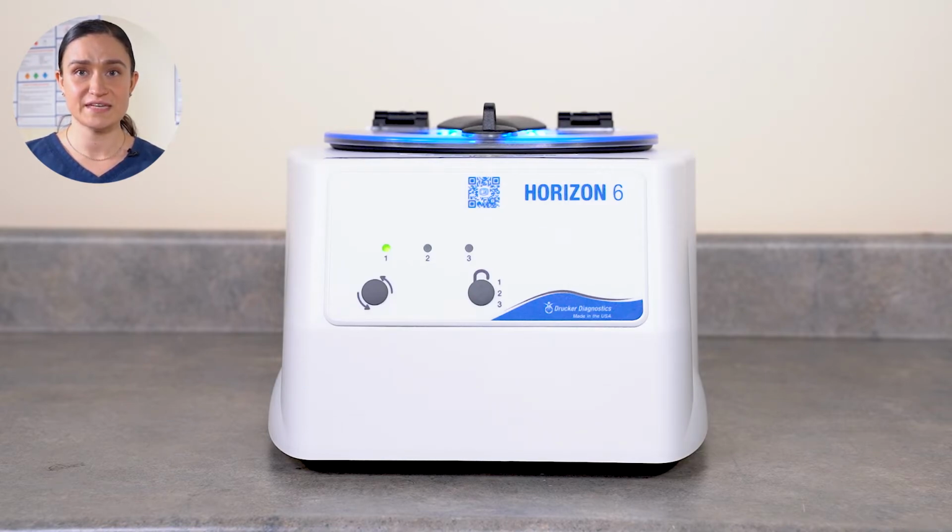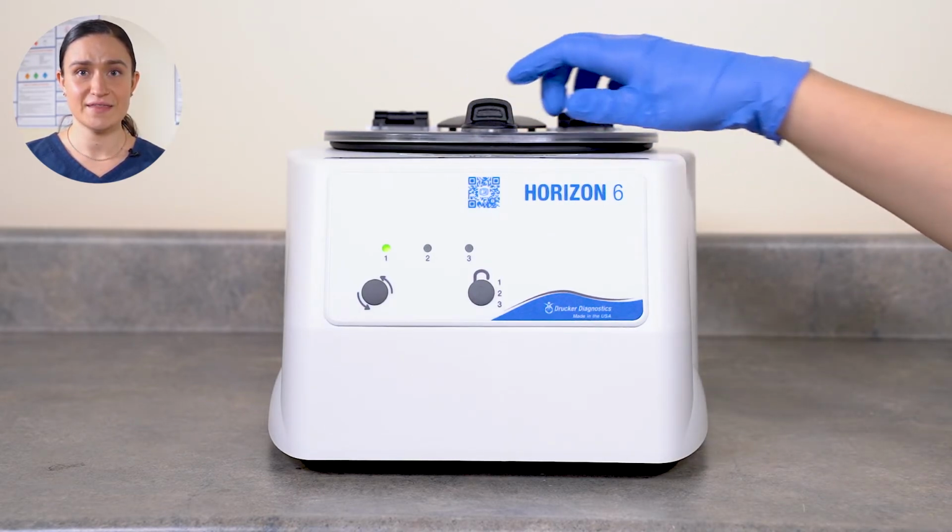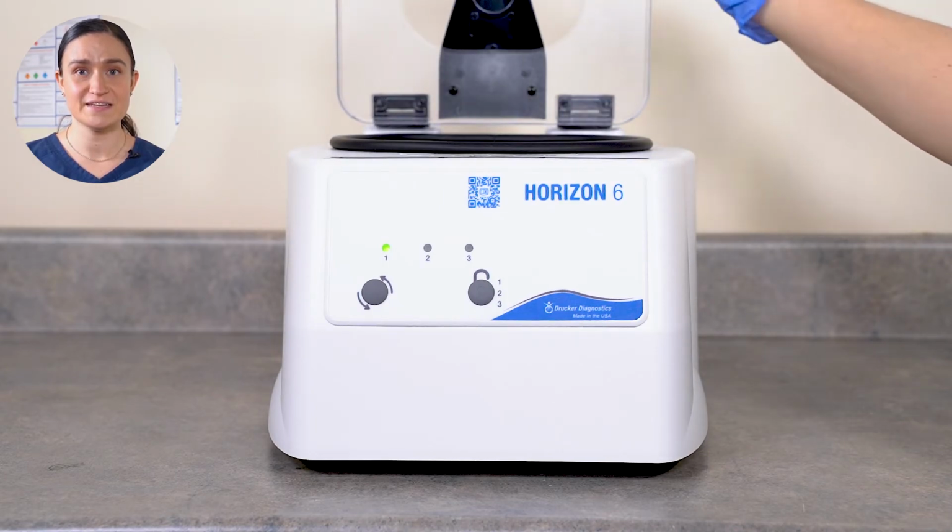Once the run is complete, the centrifuge will begin to slow down. When the rotor is fully stopped, the centrifuge will beep and the lid lights will flash to let you know it's done. The centrifuge will automatically unlock. Turn the lid latch a quarter turn counterclockwise and then lift the lid to retrieve your spun samples. And that's all there is to it. You just ran your first cycle. Now let's look at how to clean and maintain your Horizon 6.